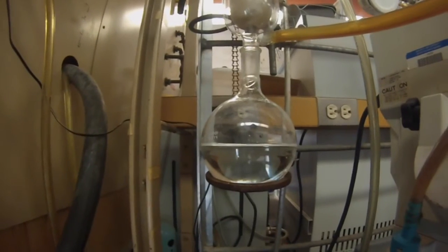Once you confirm that you have your desired molecule, you can use that molecule in further reactions all the way up until you get to your target molecule. For me, that typically consists of usually 5 reactions, but anywhere up to 10 or 12 reactions to get to your final product, often starting from something very, very simple and building your way up to very, very complex molecules.